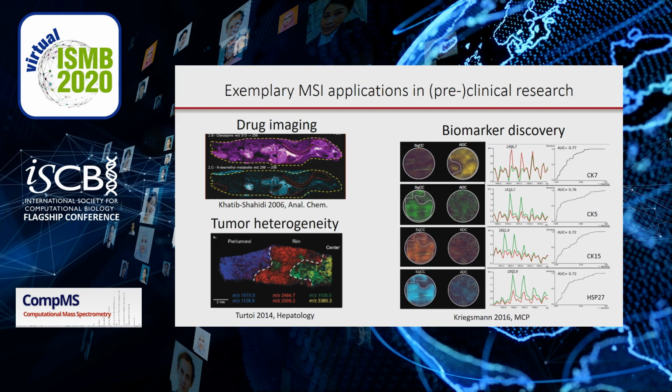In pharmacological studies, imaging of drugs and their metabolites in animal models allows the investigation of the drugs' kinetics and toxicology. MSI is often used to study solid tumors because they are spatially heterogeneous and can be virtually dissected by MSI, as seen in this colorectal liver metastasis. A common application for MSI is the discovery of potential biomarkers for diagnostic assays or the prediction of outcome or therapy response.